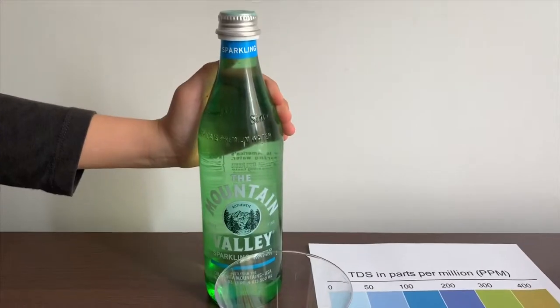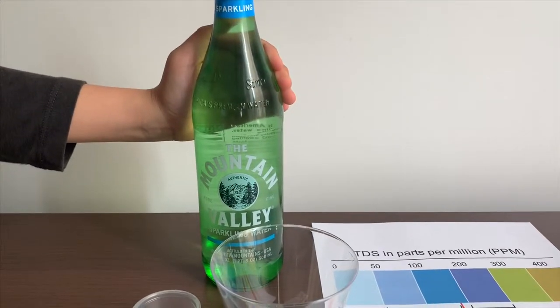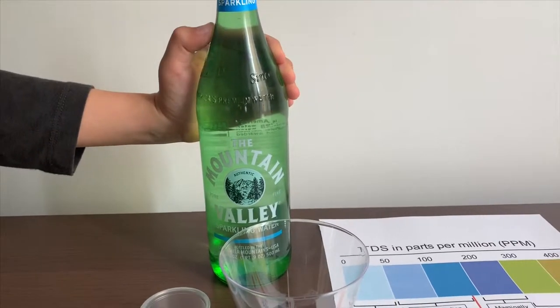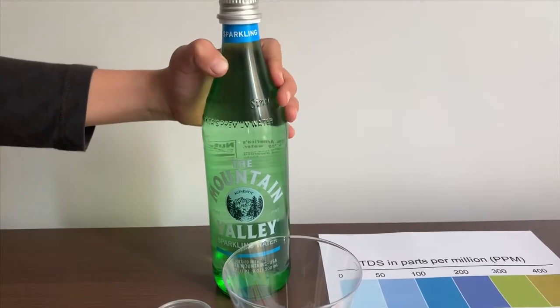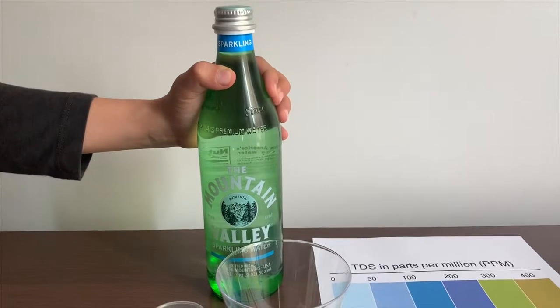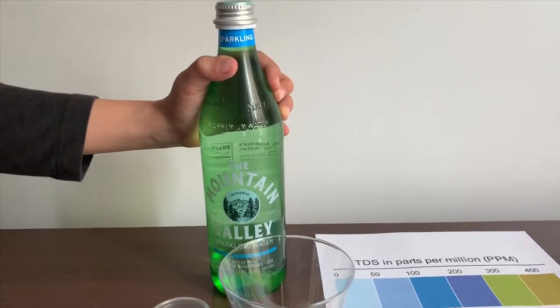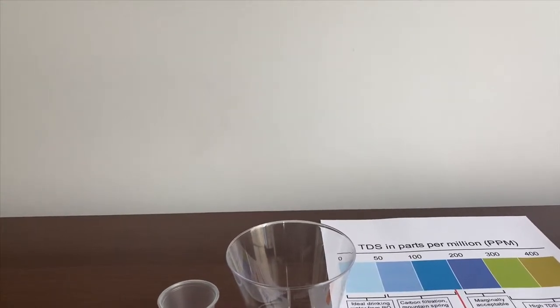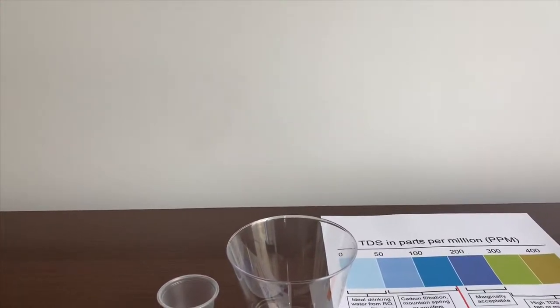This is Mountain Valley spring water. It's sparkling water and it's sourced from Arkansas. Remember we tested the still version of this? Its TDS was 189 and its pH was 8.5. Let's see how this compares. It costs $1.49.